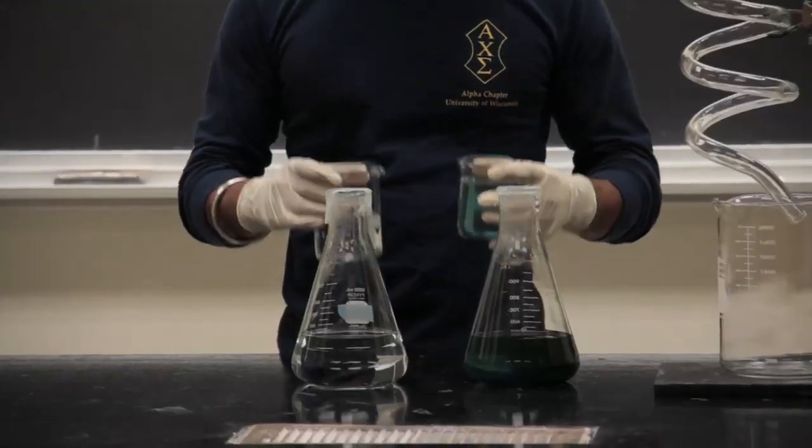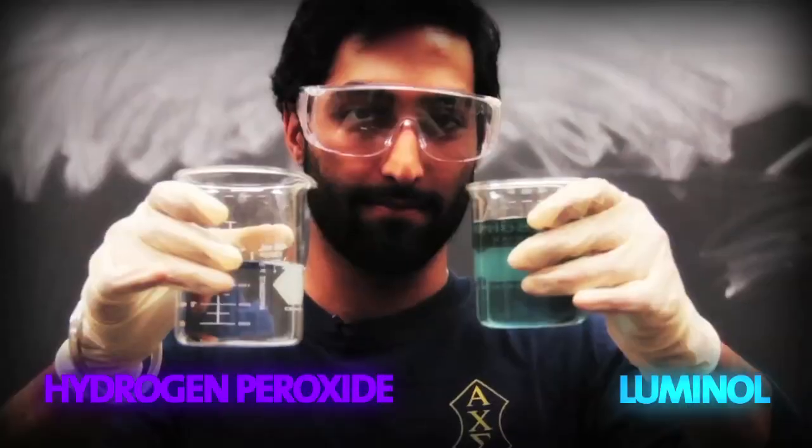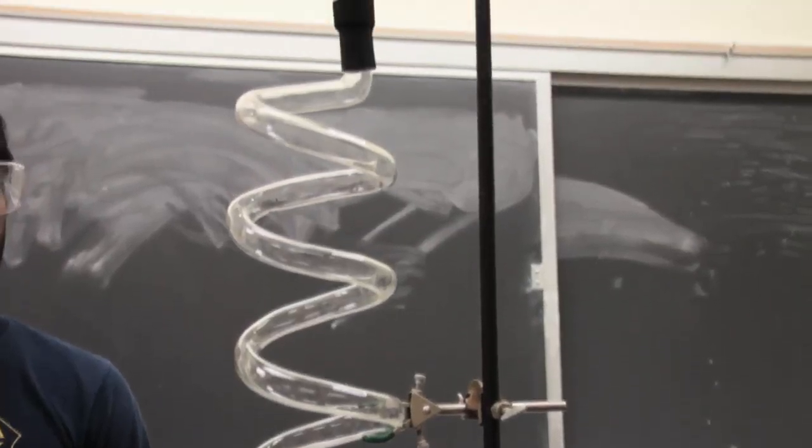That's what we're going to do here. So what I'm going to do is I'm going to take these two chemicals, Luminol and hydrogen peroxide, pour them into this cylindrical little spiral spout here and we'll see a nice glow effect happen.